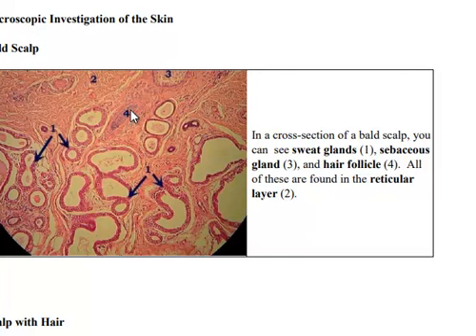So that's a little confusing. If you look up here where they've cut it away, that's part of the sebaceous glands. So if you follow this hair follicle up, here goes the hair follicle up, and then there's a sebaceous gland. But because you cut through and made a slice, you don't see the whole follicle and shaft connected to the sebaceous gland. So that's a little confusing there.